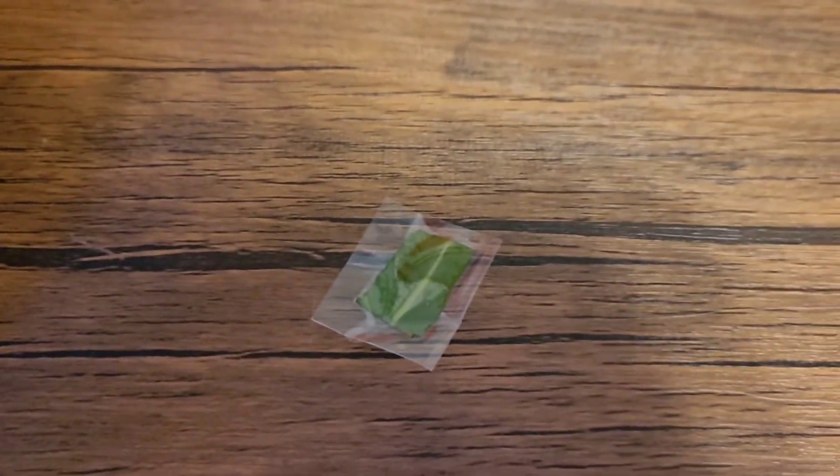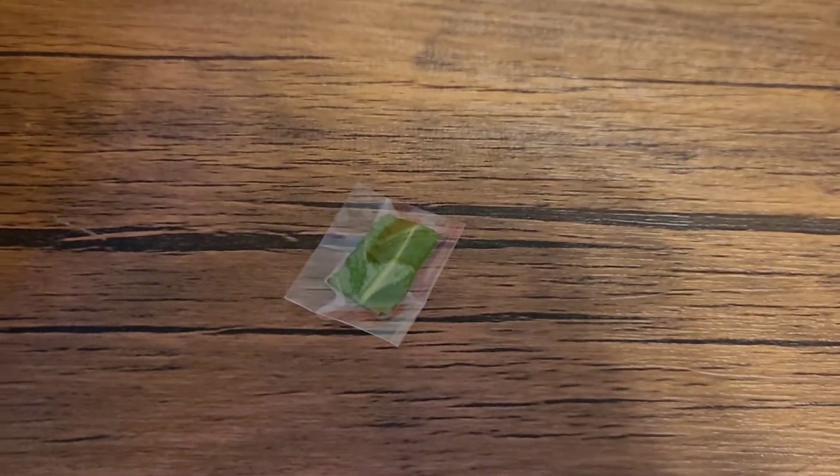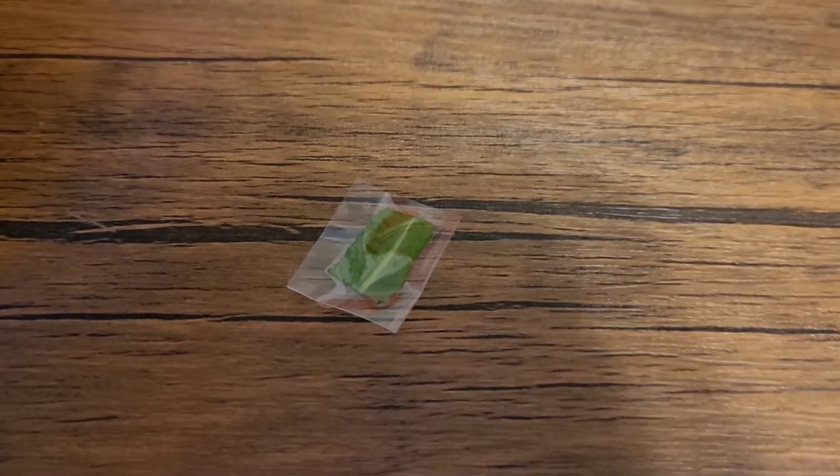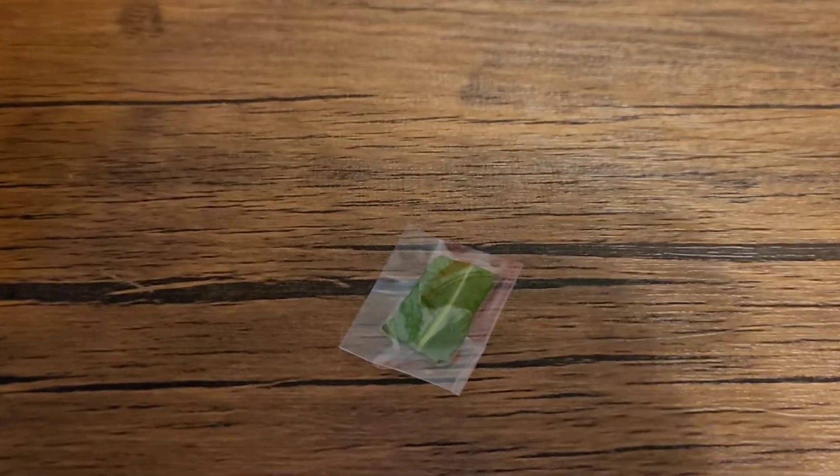Let's get started. Next up we have this leaf, and this is part of an invasive bush that grew kind of close to the house. We cut it down multiple times, it keeps coming back, so let's see what it looks like under a microscope.